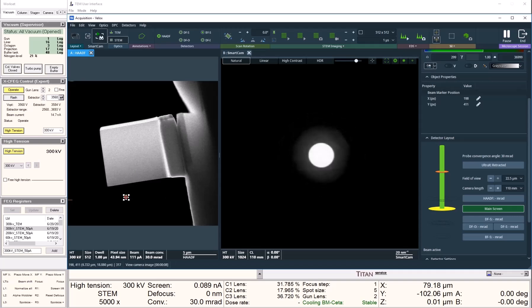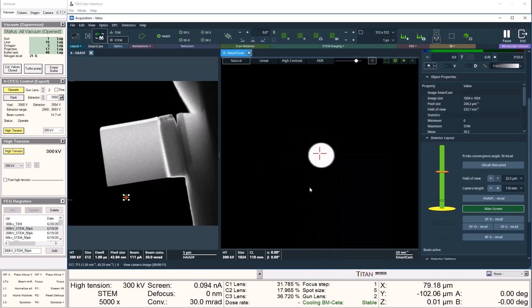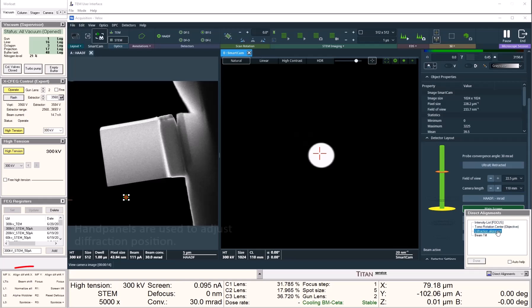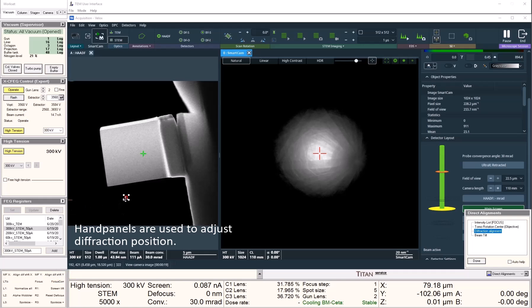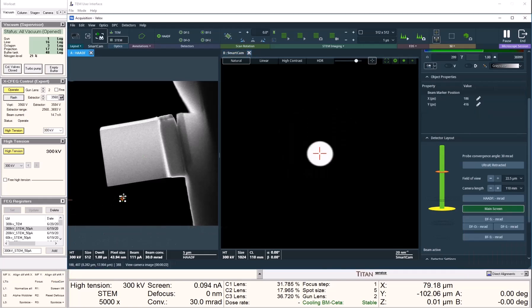We can then center the diffraction pattern using diffraction alignment. Now I'm just matching the diffraction pattern to the crosshair in the center of the window. In VLOG version 3.14 or above, we actually don't need to do this anymore because we will have simple markers in the VLOG software to guide through the process.